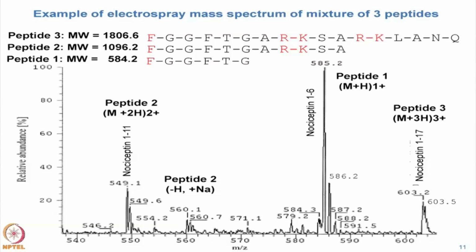Okay? But here we have easily two basic residues. When they're right next to each other, it's hard for them both to be charged. Okay? All right, but here this one has got enough basic residues. Peptide 3 is triply charged. If the mass range was expanded wider, some of these peptides would produce multiple charge states. Okay, so you would see 2 and 3, 3 and 4, something like that.